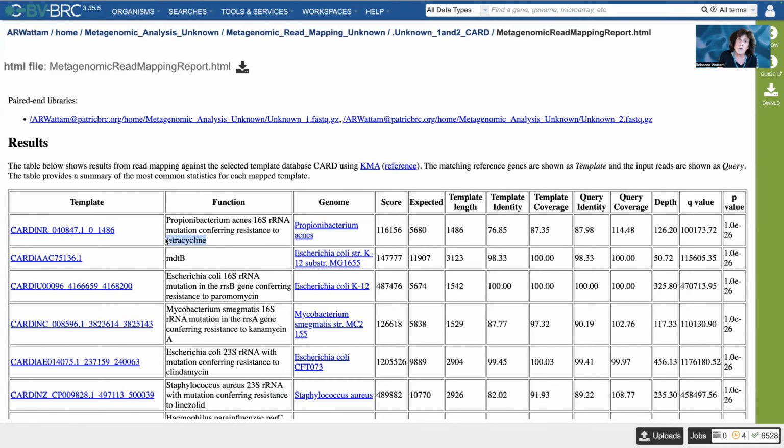This is just to show you genes that you might need to look at, but it's up to you to dig deeper to see if the specific mutations that confer either of those phenotypes are present in this gene. This just lets you know the gene is here, but you can't go any further than that. You have to dig on your own. This one is not going to tell you that.